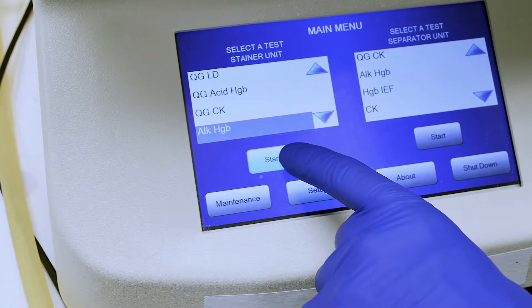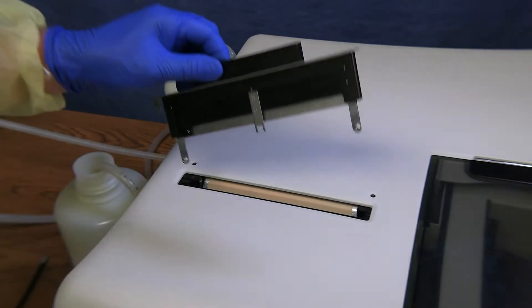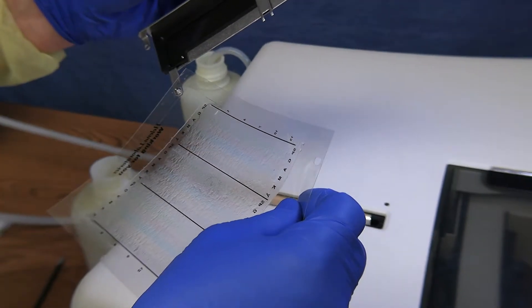Spiffy Touch has two independently operated portions, one of which handles all aspects of separation, and the other for washing and staining of gels.